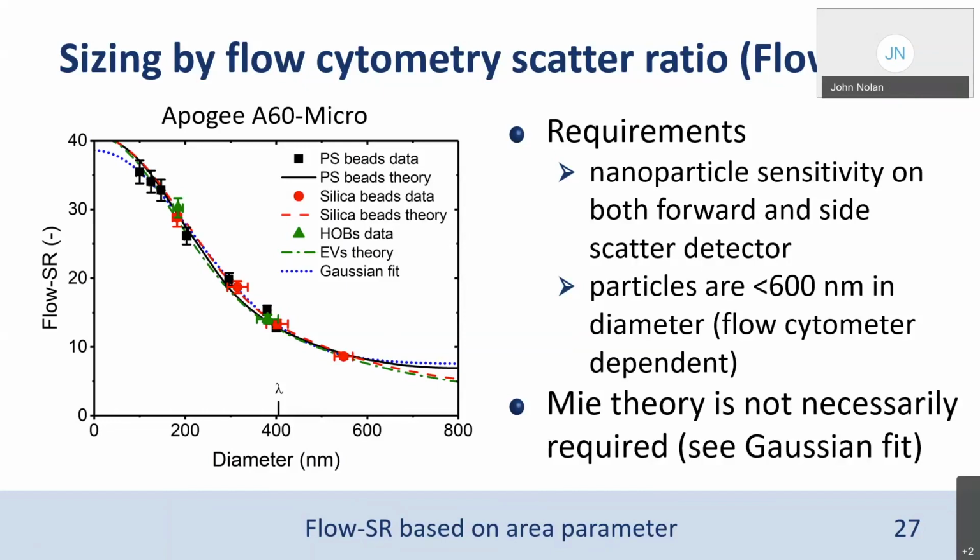Okay, a couple more questions. So Wendy asks, it has been suggested to use a neutral density filter on the SSC to quote unquote see smaller particles. Does the Apogee have this, and does this even make sense? The next question from Robert is in a similar vein. If you could make measurements with 3 different angles, presumably light scatter detectors, would this improve things?